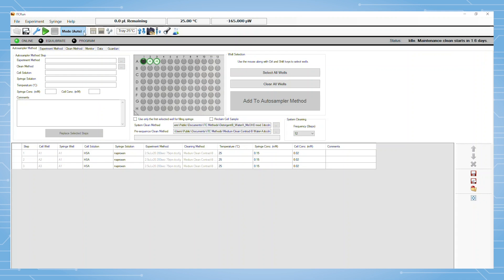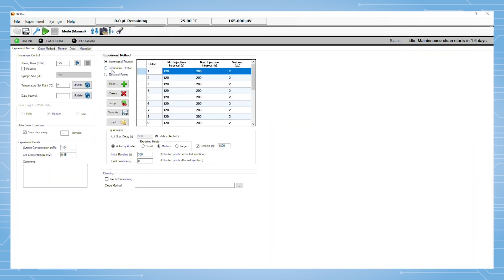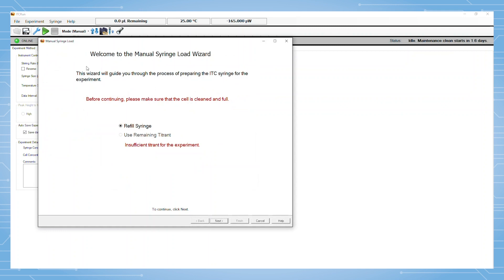The first step in loading the affinity syringe is to select manual mode if using an automated system. No action is needed for the semi-auto instrument. The green triangle or play button in the software is selected and a loading wizard is launched.